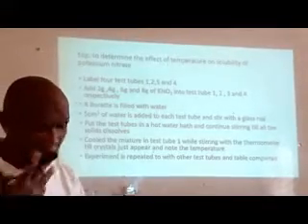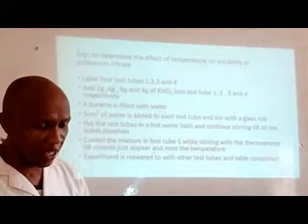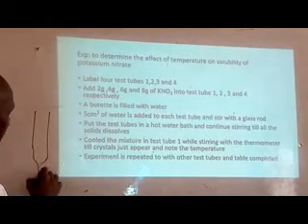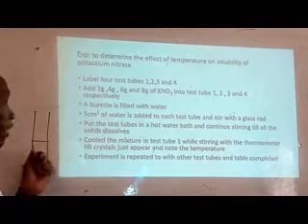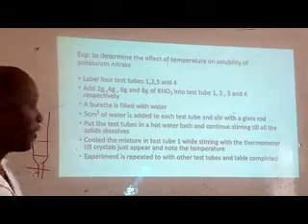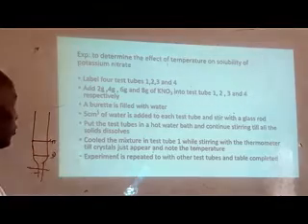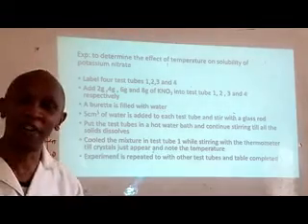And you need to be careful about how you use a burette to measure volumes, because I have seen students who just want to measure 5 and then they take a burette and fill it up to 45, then they pour everything. Definitely you realize you don't have 5. Unless you want to start from 45 and then get to 50. Well, you can't do that. But if you were at 45 and then you run everything, then you definitely have more than 5.